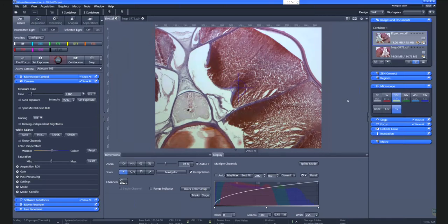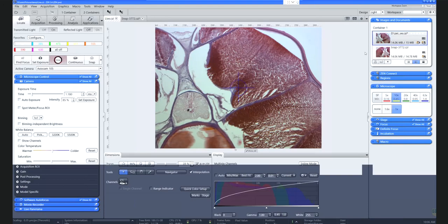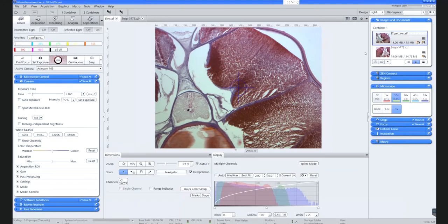make this accessible to others as well, right? A lot of people have to deal in dark rooms with fluorescent samples. That's why we decided to have a dark interface. If you prefer the light version of it, you can switch to the light interface, which looks like this for any transparent and color images like this. It would be fine. Maybe not so good if we have to sit in the dark room acquiring fluorescence images.